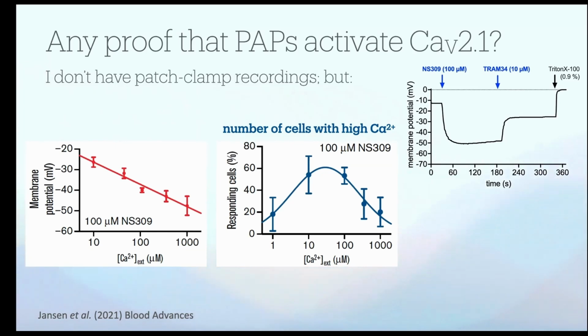It shows this stochastic behavior of openings and closings, which is compatible with a significantly increased number of high calcium cells. But if we then increase the open probability of the Gardos channel further, meaning the Gardos channel is open, this means there's no more flickering because it's constantly open, and this would mean less activity of the CaV2.1 and hence also fewer responding cells with high calcium.